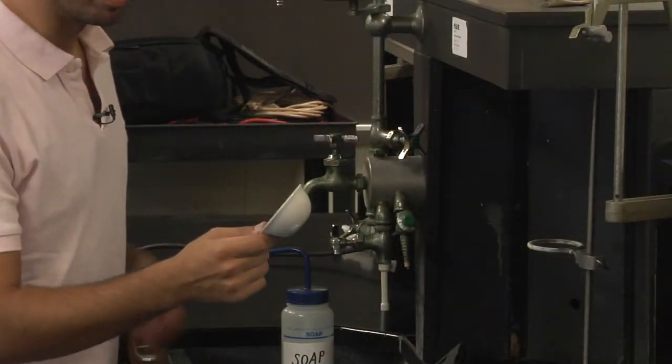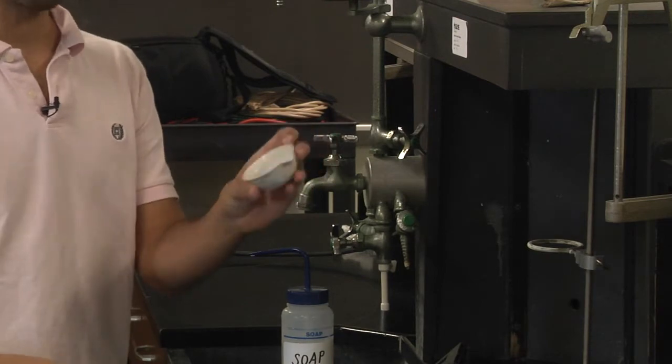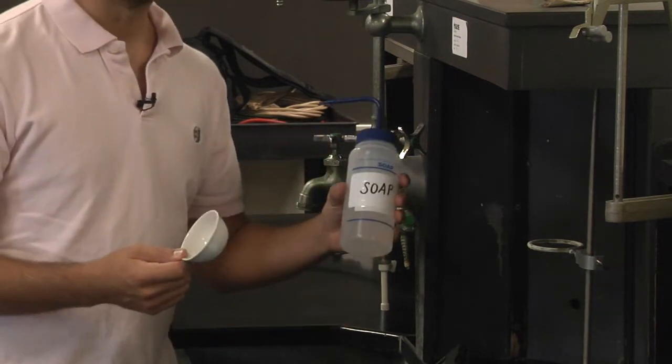Let's get started. Let's do some dishes — clean your casserole dish, which we're actually just going to use as an evaporating dish, with soap and water.